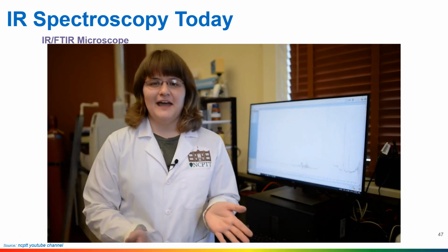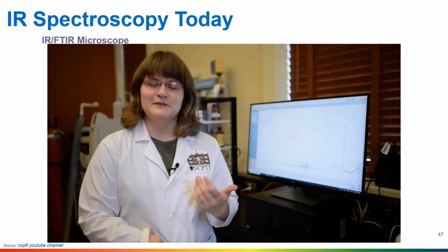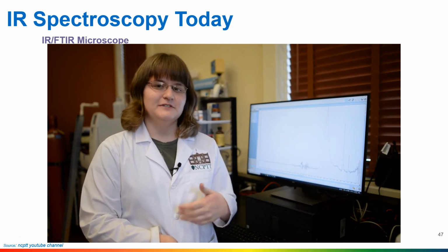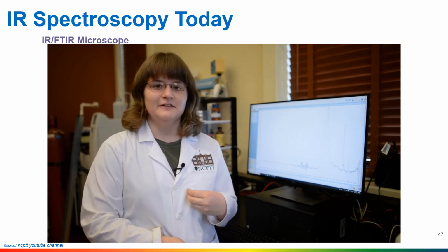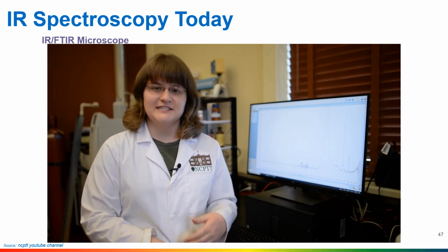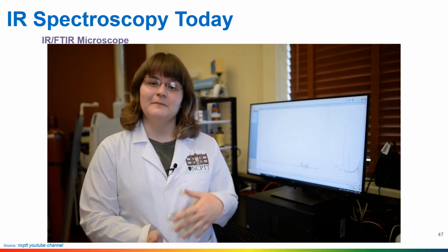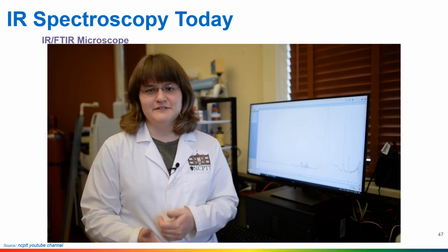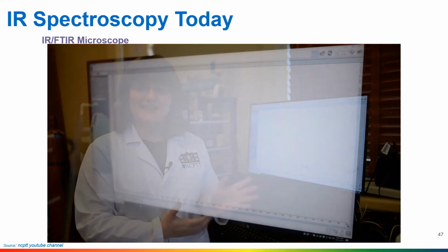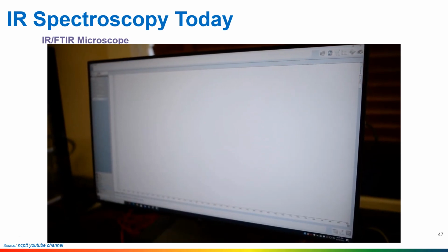So basically, we have a program on our computer that's filled with reference libraries. So what that does is it compares our spectrum to spectrums that we have from other software or spectrums that we've added from known substances, known chemicals, and it looks for matches in our spectrum to those. So I'm going to run this one through this to see if we get any matches. And again, this is our limestone sample.